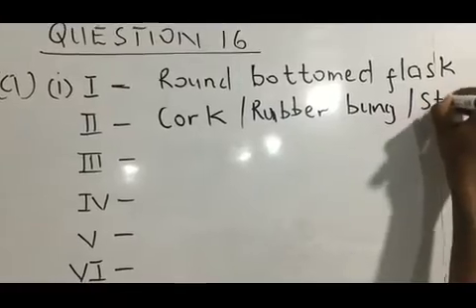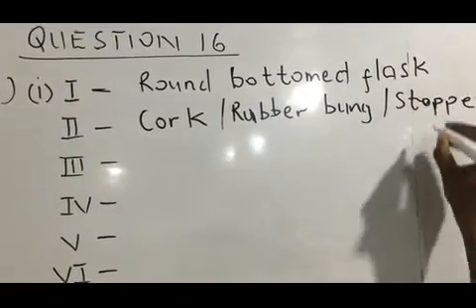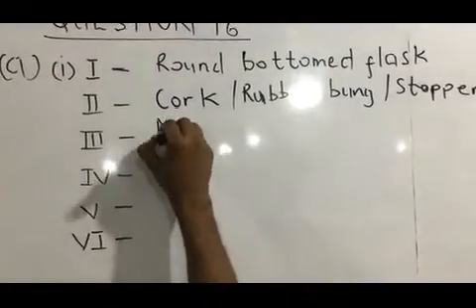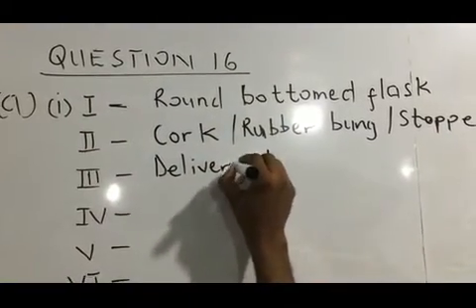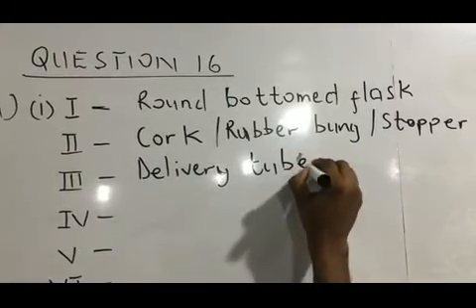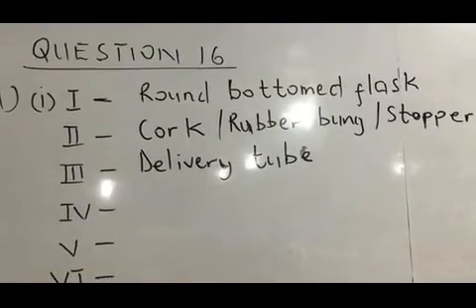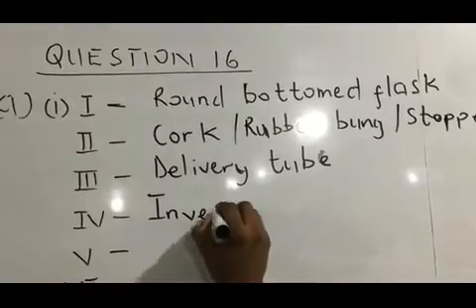Then the III is the delivery tube. The IV is the gas jar, but it has been turned upside down, so it is an inverted gas jar.